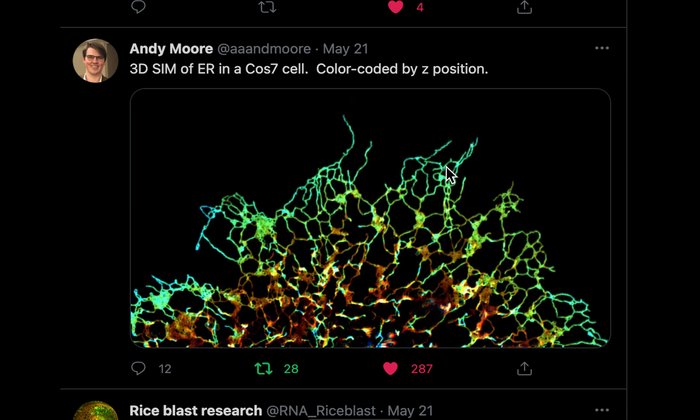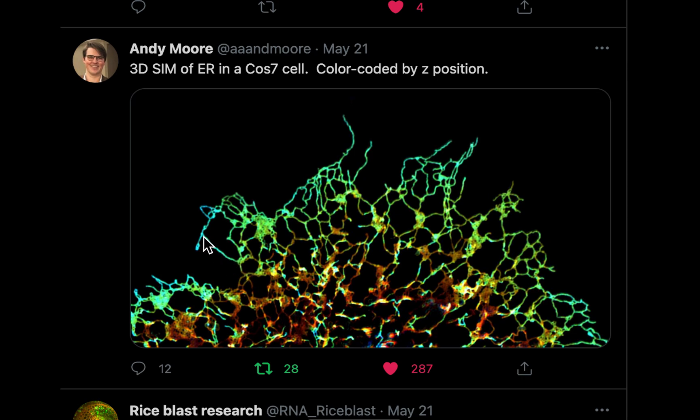What do I mean by the image carries more information? If you look at this microscope image, you can see that some objects are localized to red, some look cyan in color, some in green, because he has color-coded the sample.